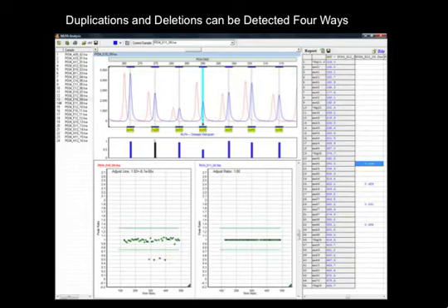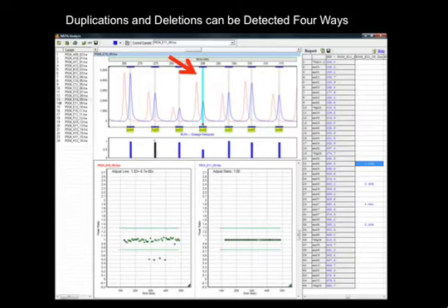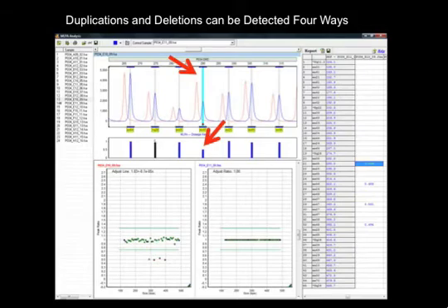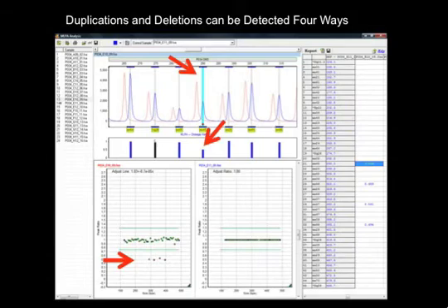Duplications and deletions can be detected in four ways: in the electropherogram with increased or decreased peak height in the trace overlay, where the reference trace appears in light red behind the blue sample trace; in the dosage histogram, where the histogram bar appears larger for duplications, smaller or absent for deletions — absent if homozygous, shorter if heterozygous deletions; and in the ratio plot, where plot points represent the peak height or area of the reference versus the sample, with color coding used to indicate the type of fragment represented by the plot point.